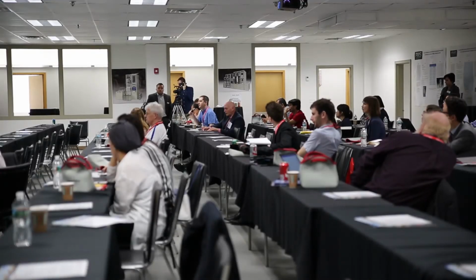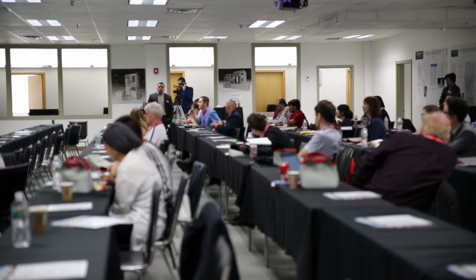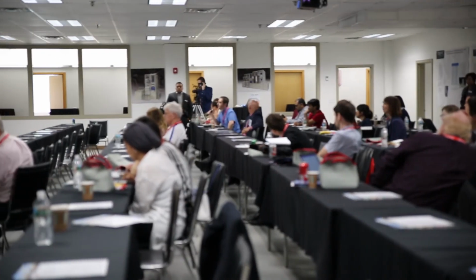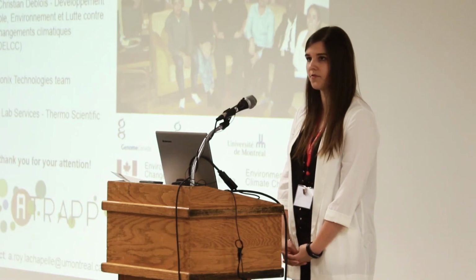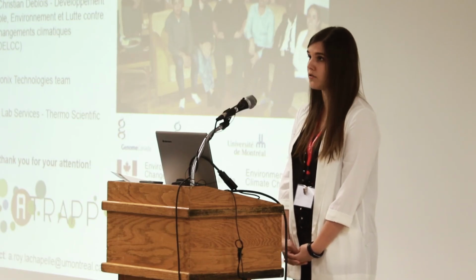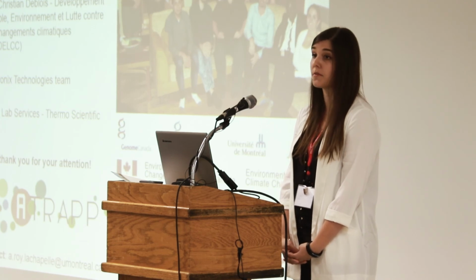You had mentioned that you do an online SPE method for these. What sorbent are you using for the online SPE portion? It's C18 from Thermo. It's a normal reverse-phase sorbent.